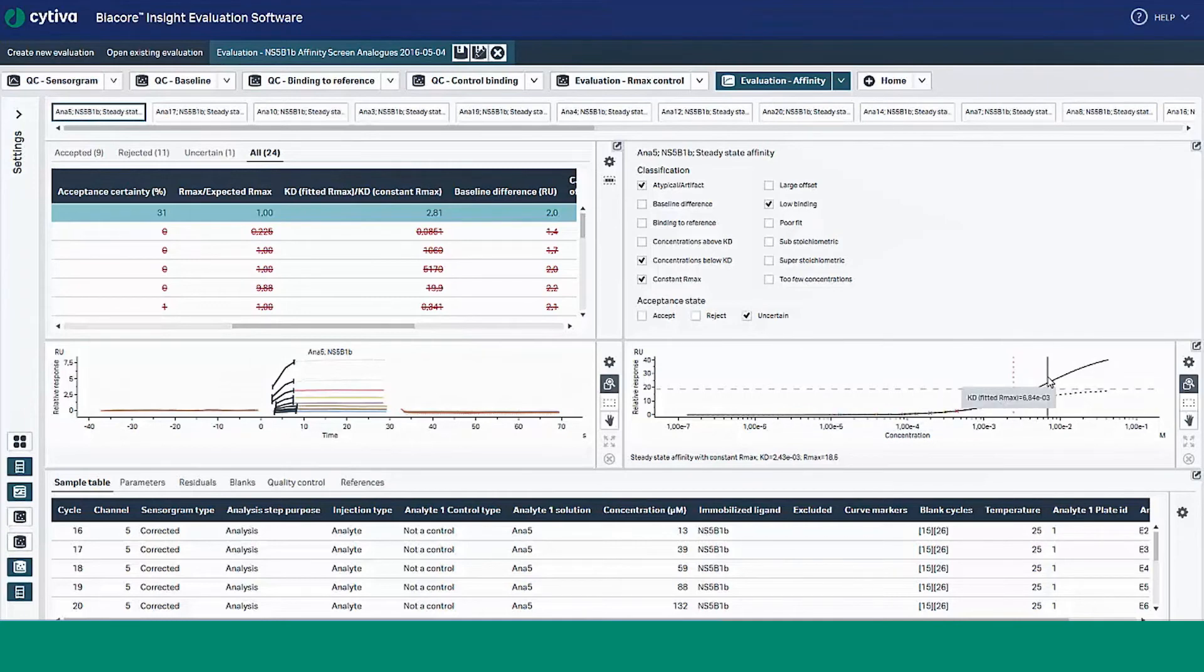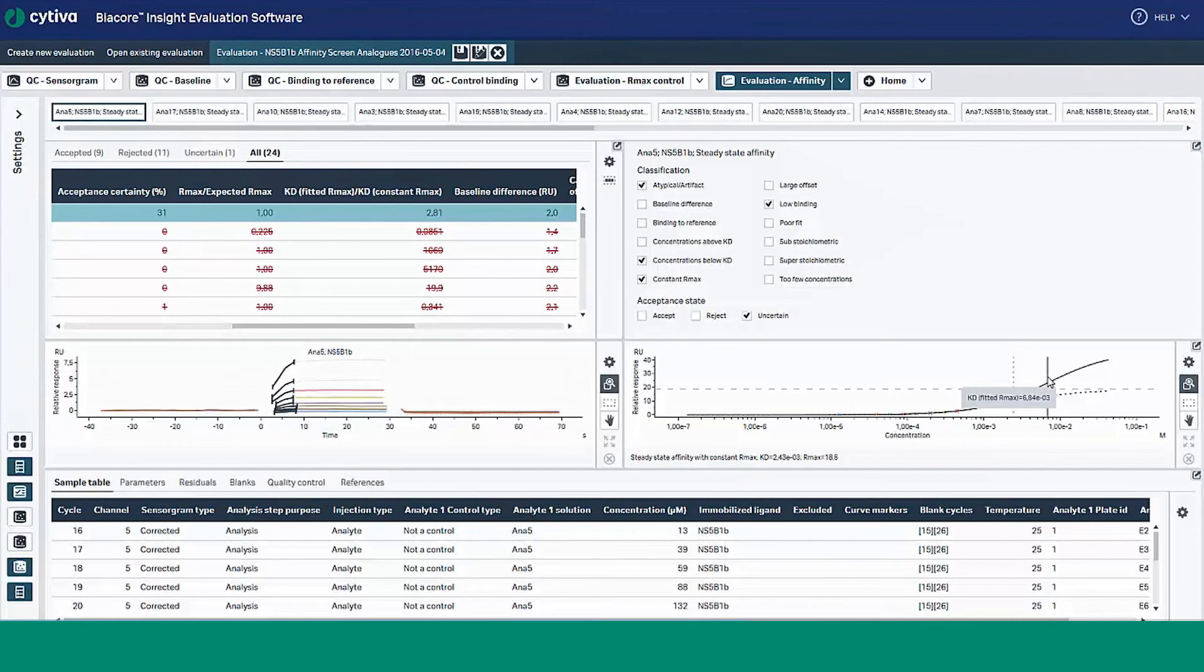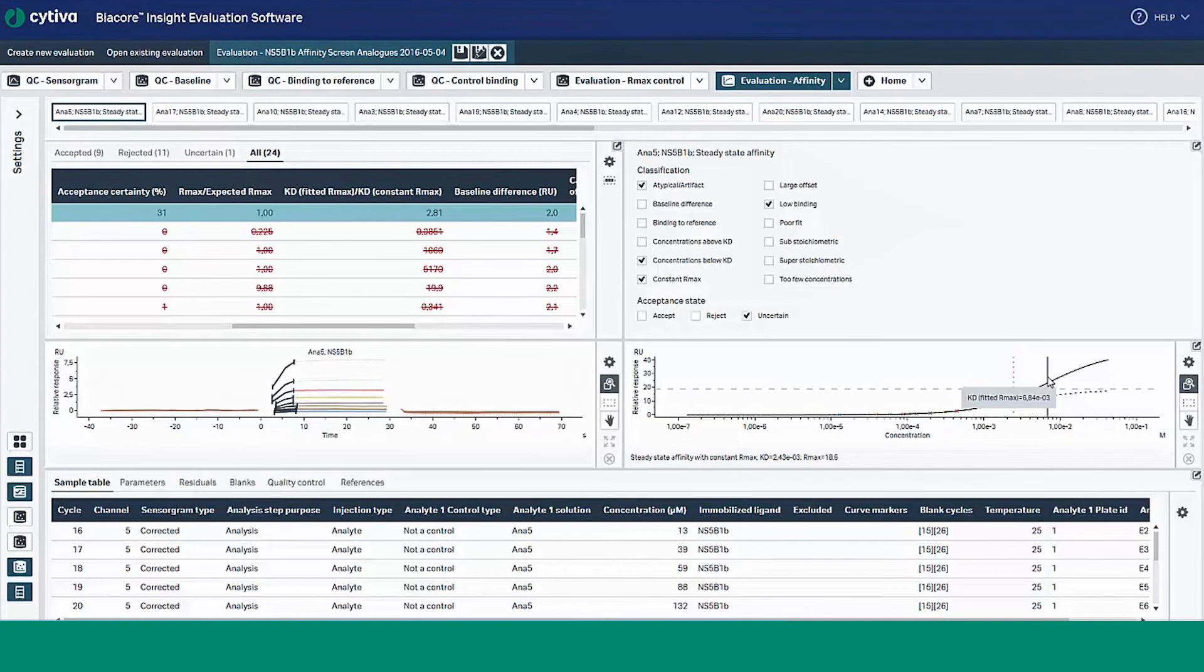The dash black isotherm is a plot of the relative response versus concentration with steady state affinity model applied with a constant RMAX. The expected RMAX is obtained for each analyte from the response of a control analyte, RMAX control, and the relative molecular weights of a control and sample. The dash vertical line denotes the KD determined from the constant RMAX.